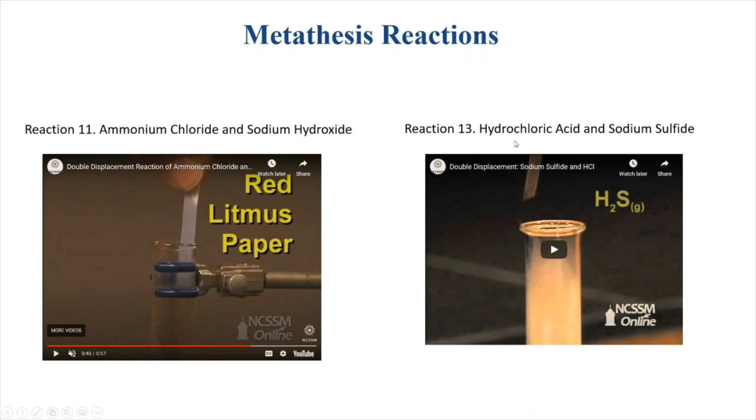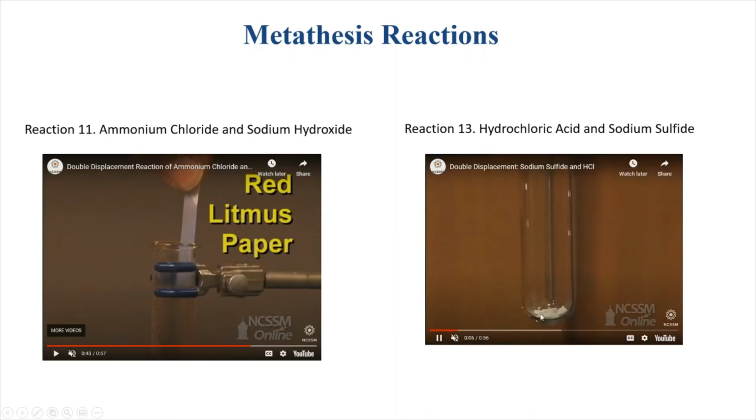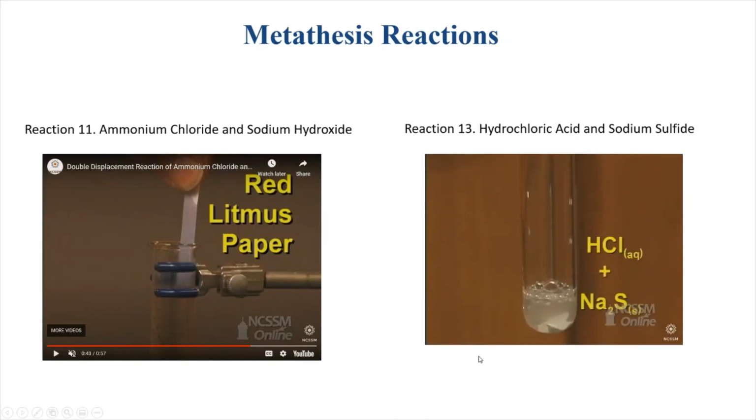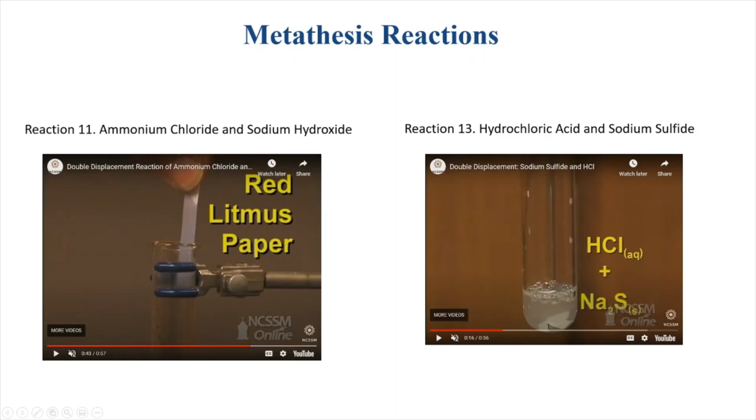Now, let's take a look at hydrochloric acid and sodium sulfide. So sodium sulfide is down here as a solid, and they're going to add a little bit of hydrochloric acid to it. Now, so that's basically the observations that you would see in lab.